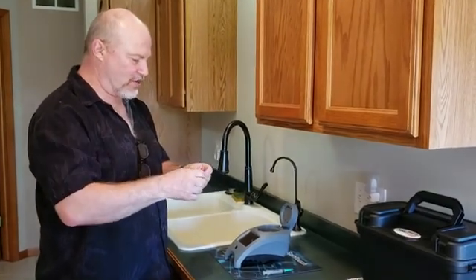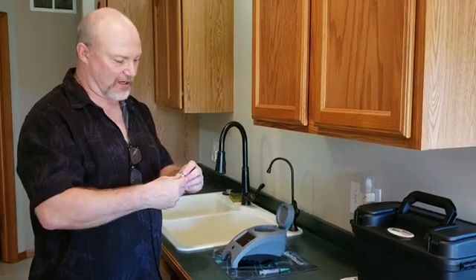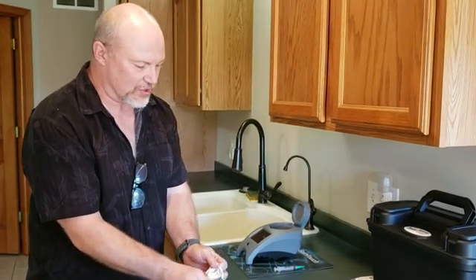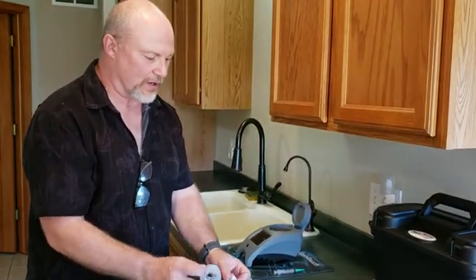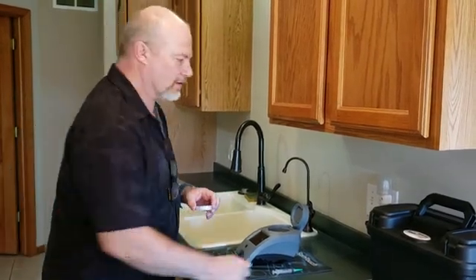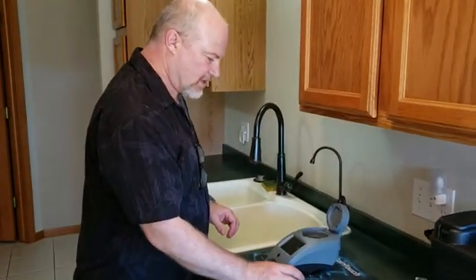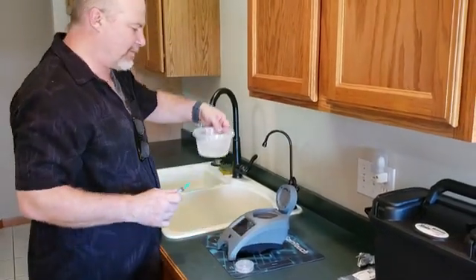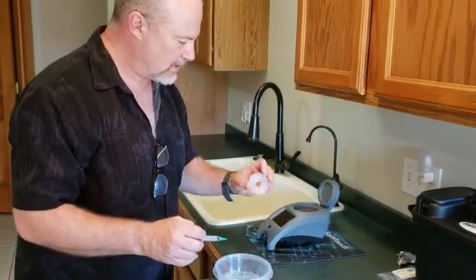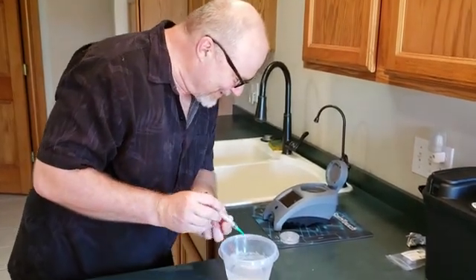I've already pulled a sample because I do have a water softener in this home, so I pulled a sample directly from my well downstairs. I let it run for a little while to make sure I was getting water directly from the well, not from the pressure tank.